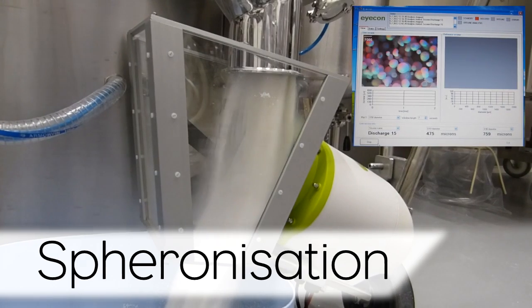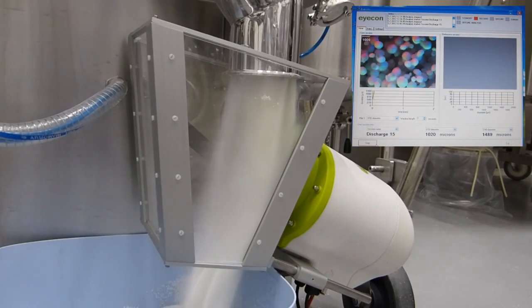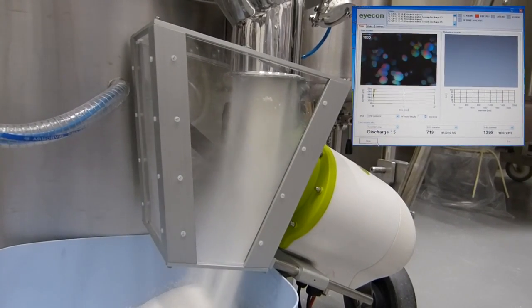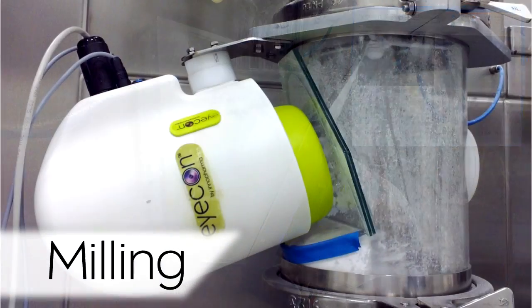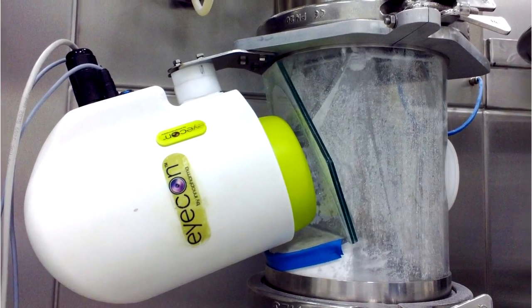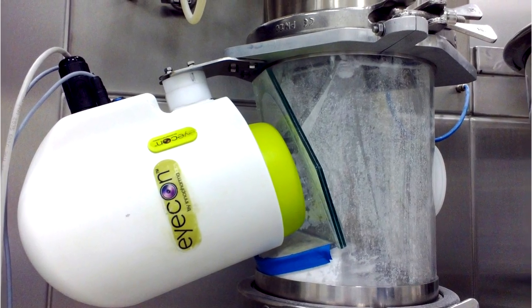Spheronization, where shape information and particle images can be used to ensure reliable dissolution results, and in milling, to detect damage to the mesh affecting the particle size distribution at the output of the mill.